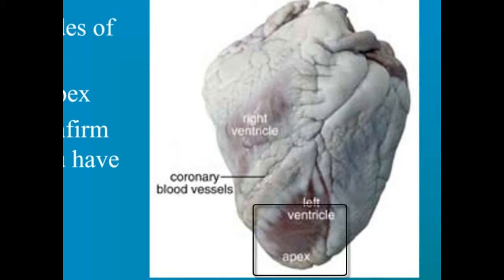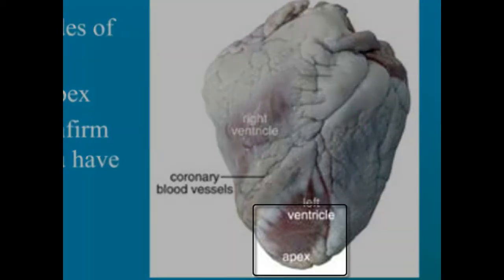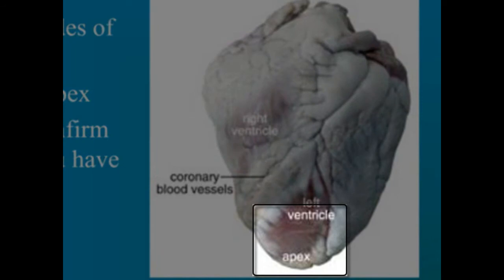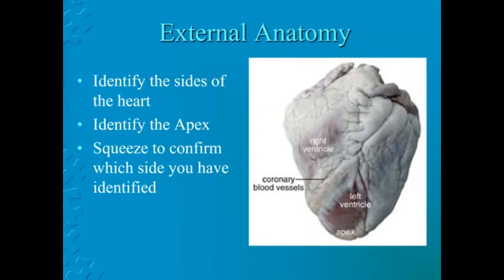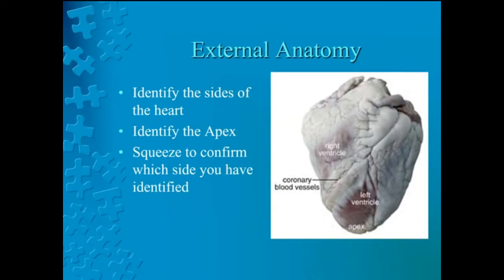One way to confirm that you have correctly identified the right and left side is to squeeze each half. The left half will feel much firmer and more muscular than the right. The left side of the heart is firmer and more muscular, and therefore stronger, because it has to pump blood to the whole body, while the right side only pumps blood to the lungs. Before you squeeze the heart, make certain that it is facing down so that any fluids do not squirt at you. Pause the video at this time to identify the sides of the heart.